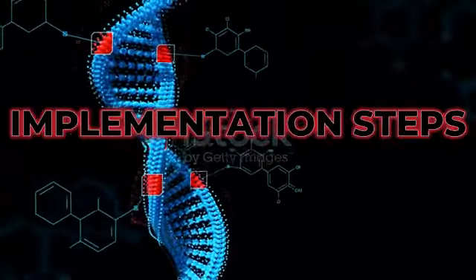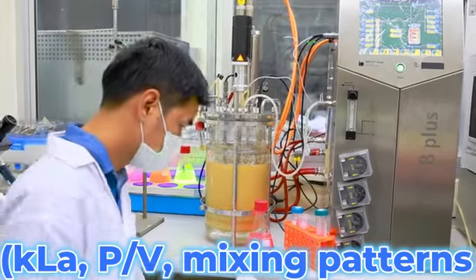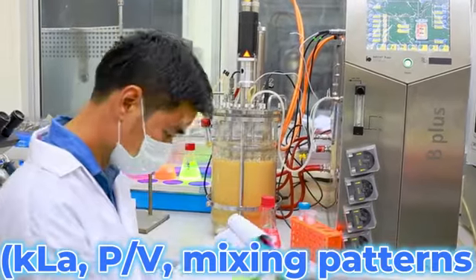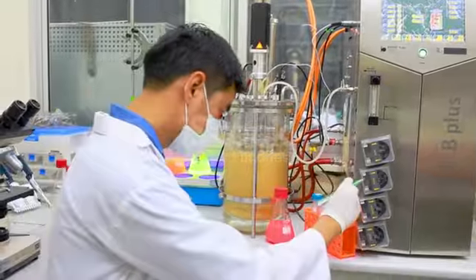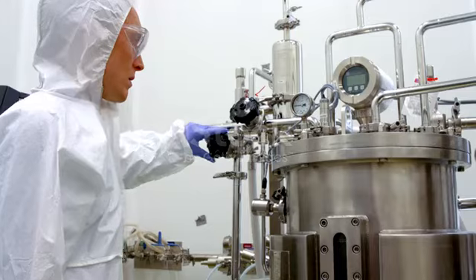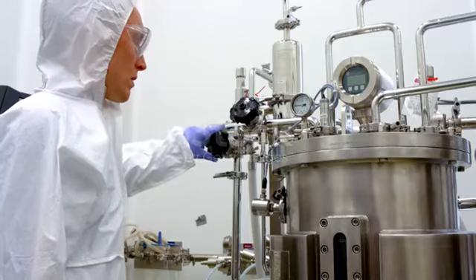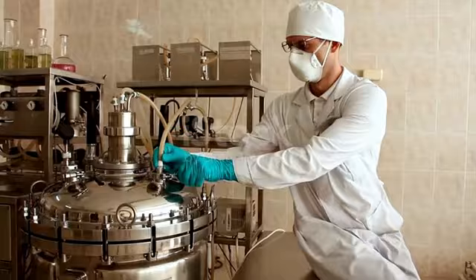Implementation steps. Calibrate the physical reactor, KLA, P/V, mixing patterns. Build a computational model with mass balances and kinetics. Integrate sensors plus data pipeline. Train the digital twin using initial process runs. Deploy for real-time predictions and control.